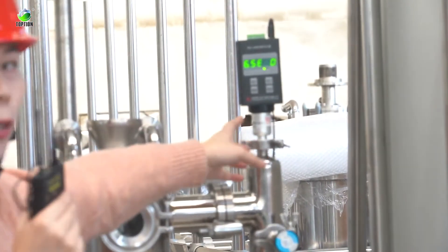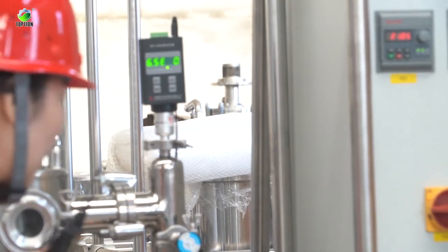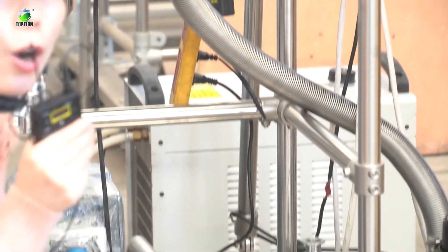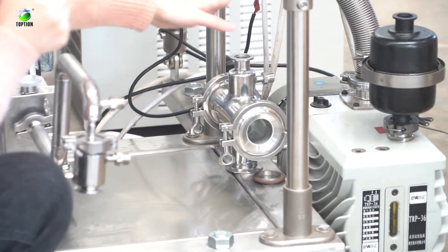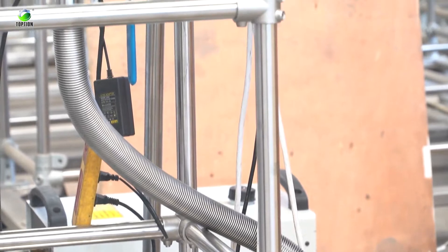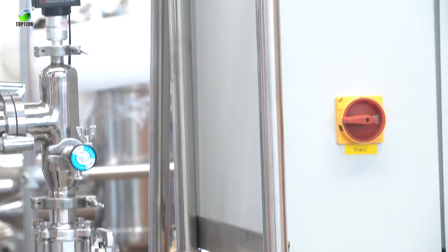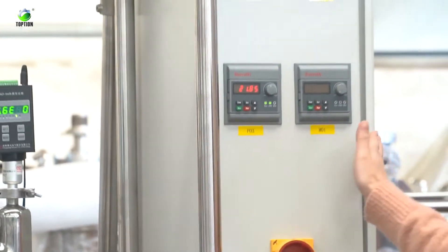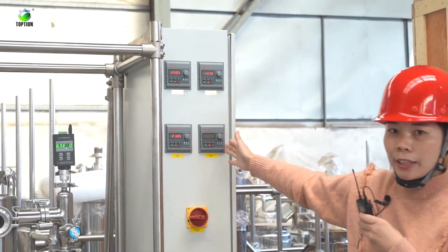Beside the chiller connection port, there is a vacuum meter. Then comes the vacuum system — we use oil-type rotary vane vacuum pumps. The vacuum level now is about 0.5 to 0.6 mbar.